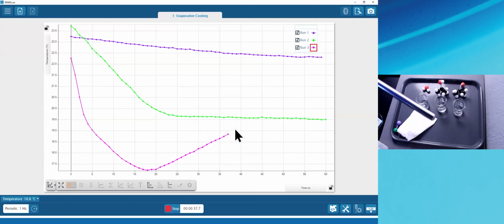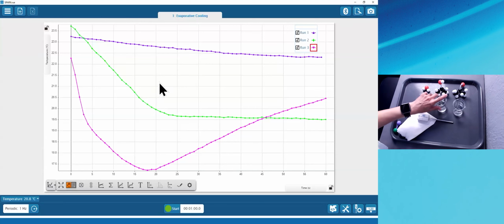and this is a nice demonstration of how the properties of all these liquids vary based on what's dissolved in them, if anything. Water is just water. Isopropyl alcohol is a mixture of mostly isopropyl alcohol plus water, and this is 100% acetone, and it completely evaporated within 20 seconds. It was gone. And holding perfectly still, because if they move, they're going to bias the data a little bit. So there's 3 runs of data just like that. Very quickly, we can do part 3 of the lab, where it tells them to use our molecular model set that comes with Essential Chemistry and build water.